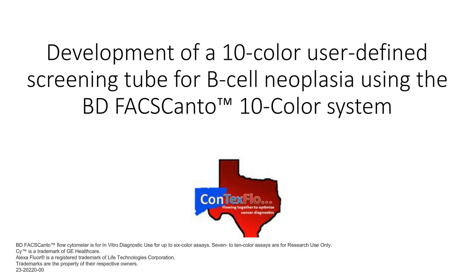We did try hard to put CD200 in, but that was very challenging because we need a very clean background, and we just couldn't achieve it with the various spillovers, as well as a bright stain. So we couldn't get that in.